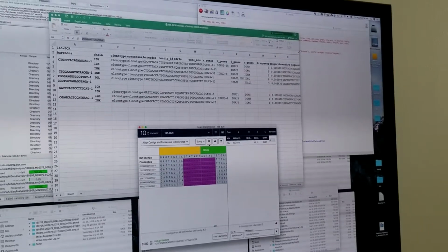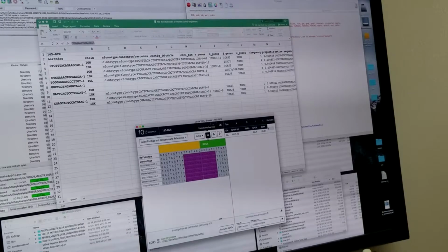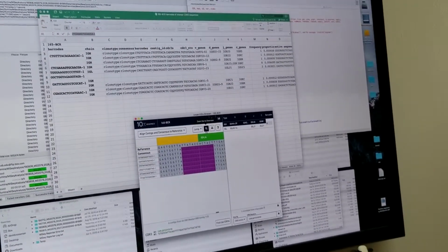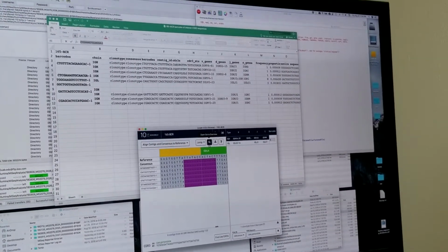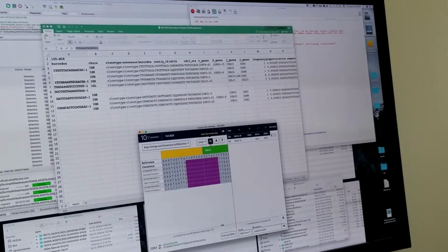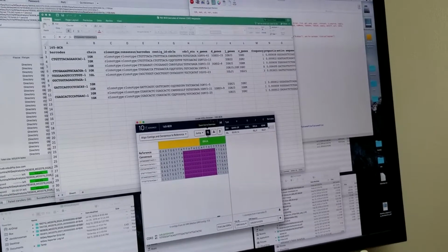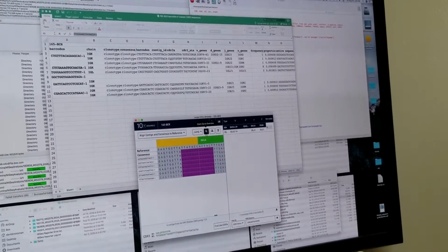It seems like it likes to start... I mean, that one had the deletion. All the sequences came from the start position, that's sort of after the deletion or something like that. Like there's a problem with sequencing through that. And then it would say, okay, there's nothing back there, and the other said, well, nothing up here, and let's call it a deletion kind of thing.